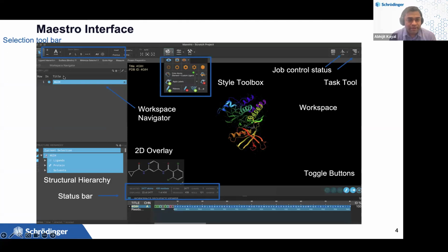And in the left hand panel, exactly, this is called the workspace navigator. The black region or black space is called the workspace, and this is called the workspace navigator. It means that you can navigate what you want to achieve here. You can make changes here, and you can direct what you want to do, and you can visualize that in your workspace. So that is why this section is called workspace and navigator.